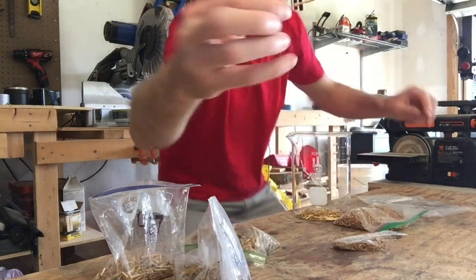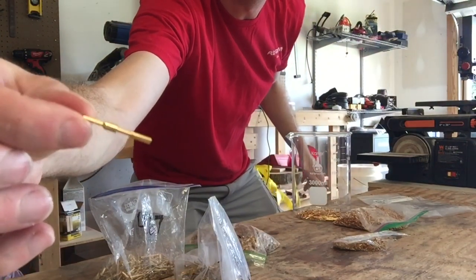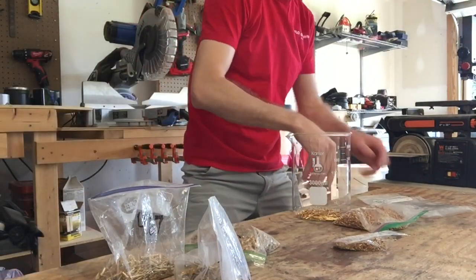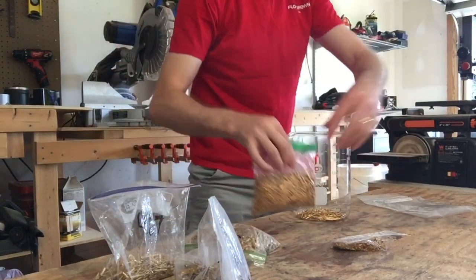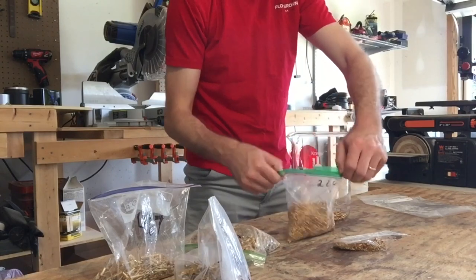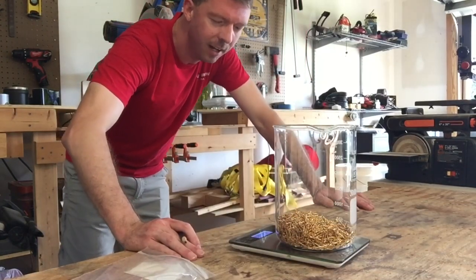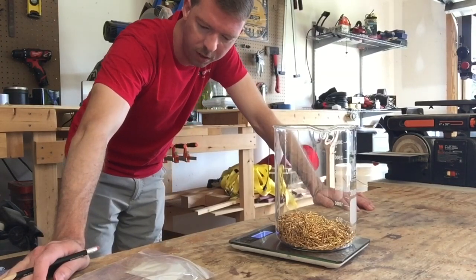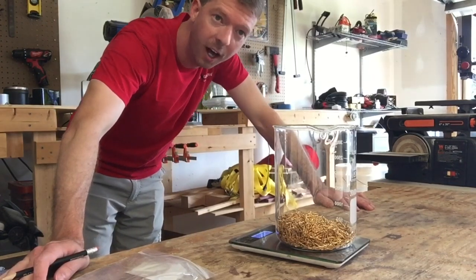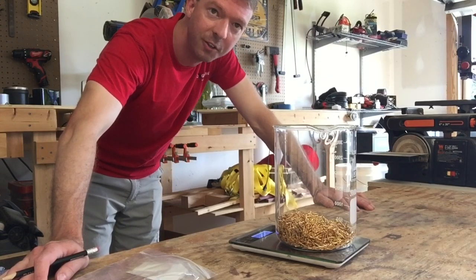These pins have a real good shine on them. I just weighed out all my pins, subtracting the weight of the beaker, and it looks like we have 1190 grams of military-grade gold-plated pins. We're going to get started with our nitric acid treatments and see what kind of yield we can get out of these.